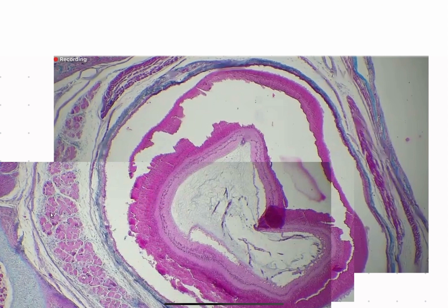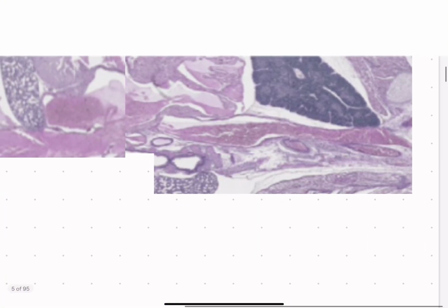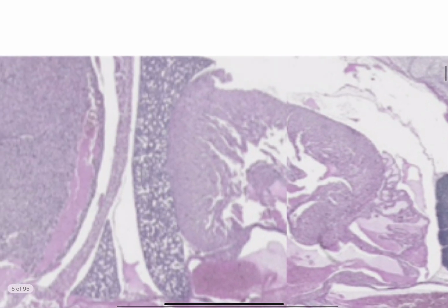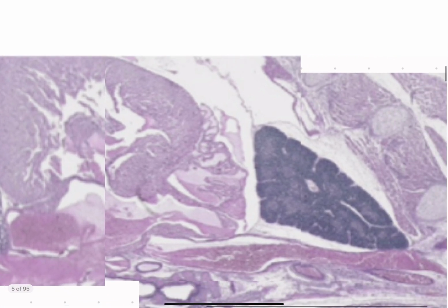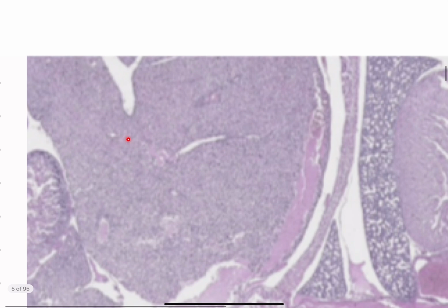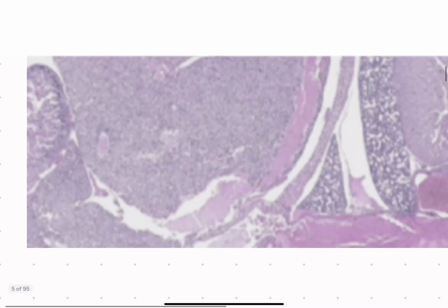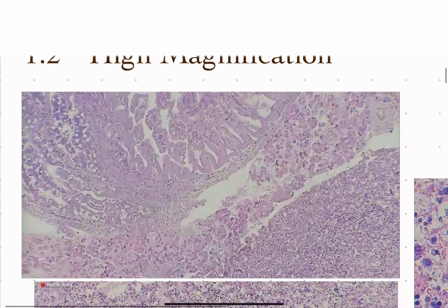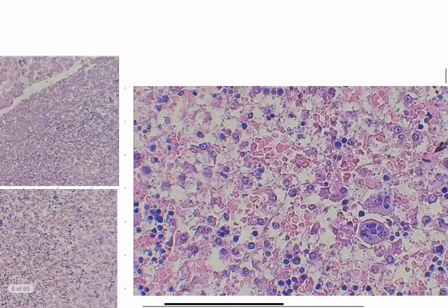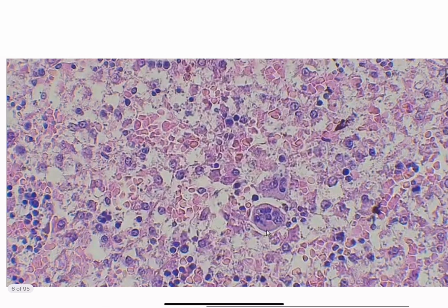Okay, next slide is another zoomed in version. And here we're going to see this first. And then we're going towards the left upper side. So please pay attention to where we are. Write down the slide name. And now we're zooming in towards this general area. And we see this. And then going towards this area, I know it's a little bit wonky, but bear with me. We see this. Once we zoom in, we see something like this. Please write down the name for this structure.